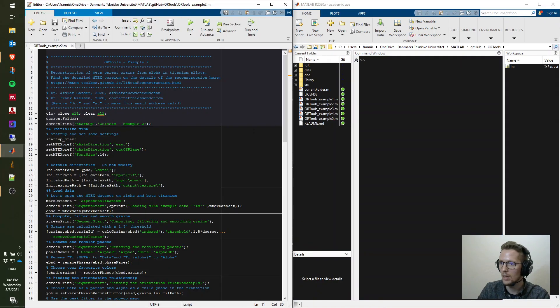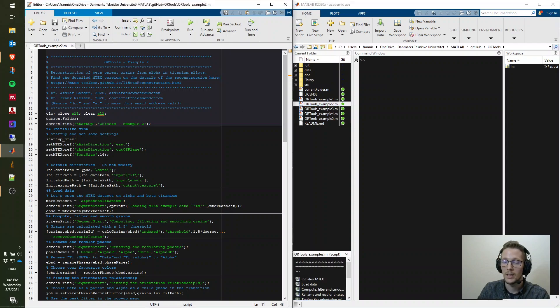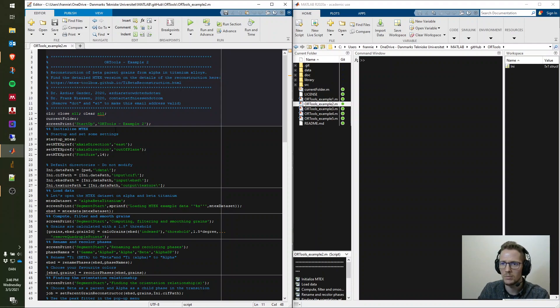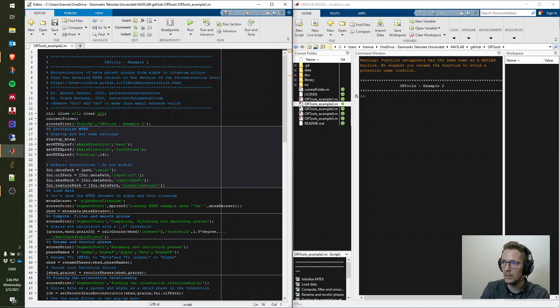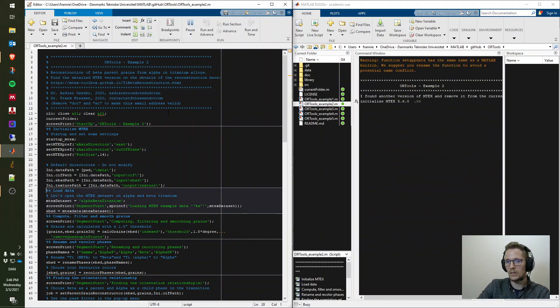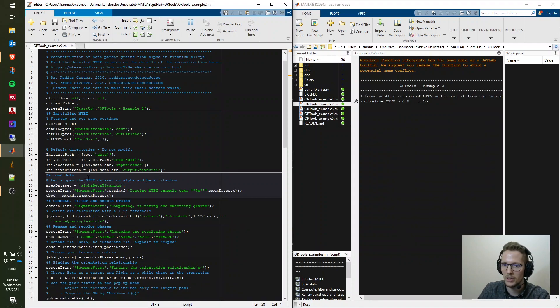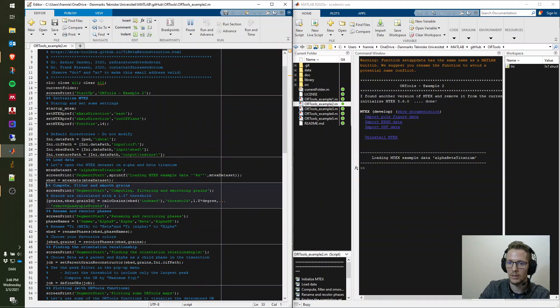We have MATLAB open, we're in the folder of the toolbox, and we open the example two file. We're going to start running the script section by section. If this is the first time running one of these scripts, I'd encourage you to watch example one for more detail on the functions. We run the first section which initializes everything, set up MTEX, set up the folder structure, and then load the data.